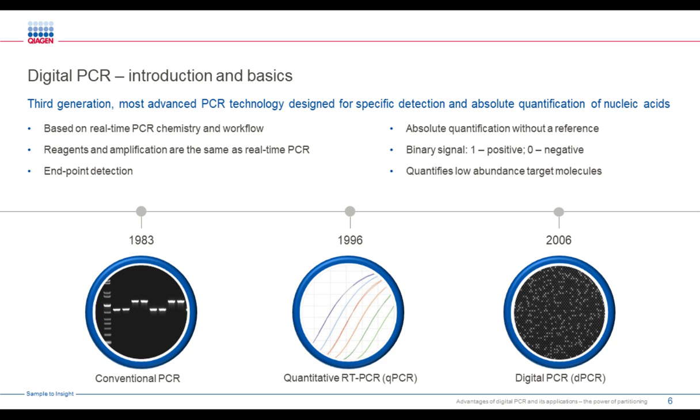The second generation of PCR was when we advanced the PCR into real-time PCR. Then we started to use intercalating dyes, hybridization probes, hydrolysis probes, molecular beacons or scorpion probes to actually see what happens after each cycle. This is very important because real-time PCR gives us relative quantification. This means that we need something to compare against. We also use standard curves. We rely on efficiency because we need to know that every cycle has been amplified or duplicated perfectly to 100%.